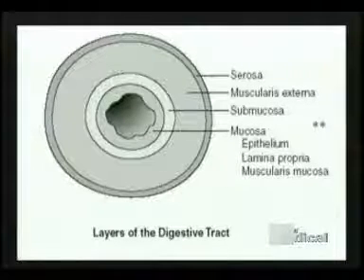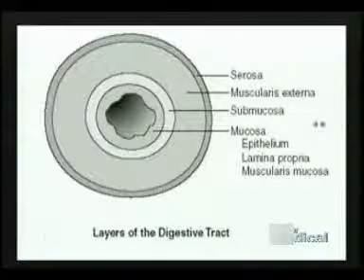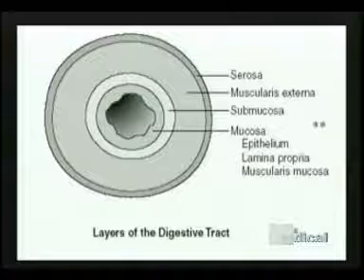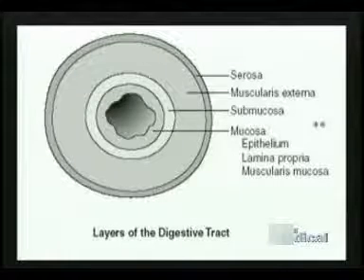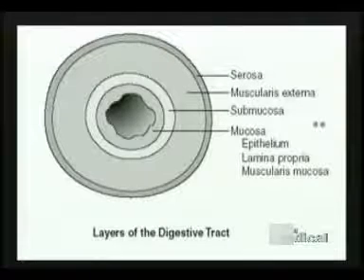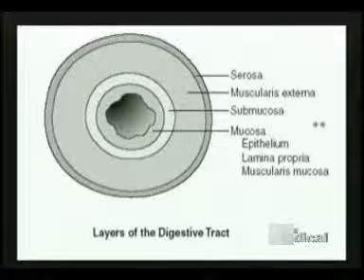It is in the area of the mucosa where we see the most distinct differences in various components of the GI tract. Underlying the mucosa will be an area of submucosa, then in one region of the GI tract, the duodenum, which will contain some prominent glands. Underneath that are circular and longitudinal layers of the muscularis externa, basically consisting of smooth muscle.